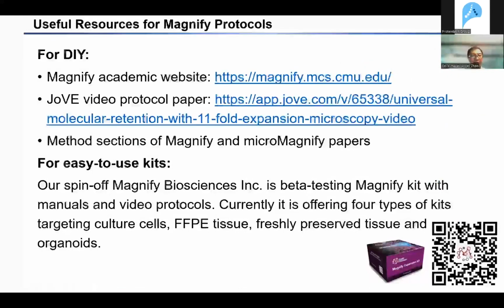So I hope that you will be interested in using Magnify protocols. There are 2 ways to do it. You can do it yourself. In this case, we provide you some resources. For example, we have a website that you can use to purchase those reagents. You can also look at the video protocol paper that we published in JoVE.